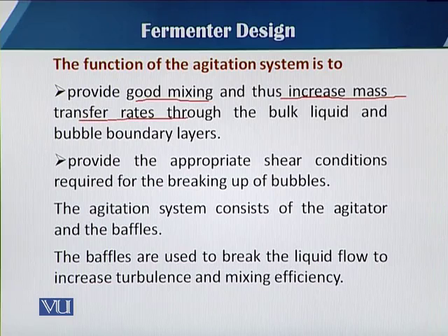The agitation system provides good mixing. With good mixing, there is increased mass transfer. What is mass transfer? Mass transfer can be talked about in the liquid and the bubble boundary layers.